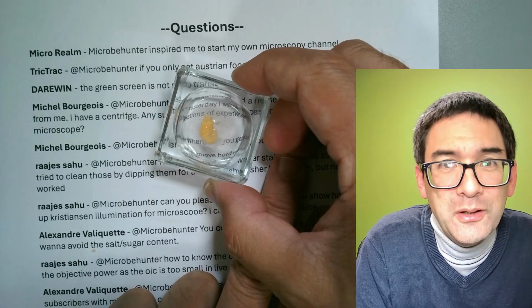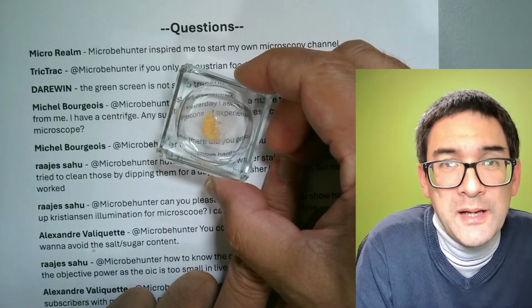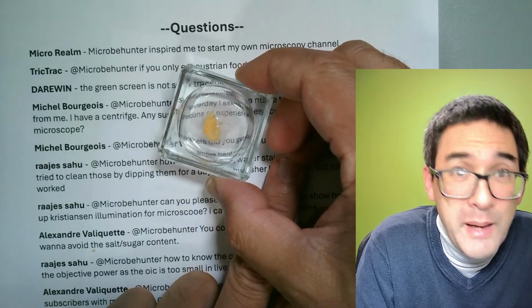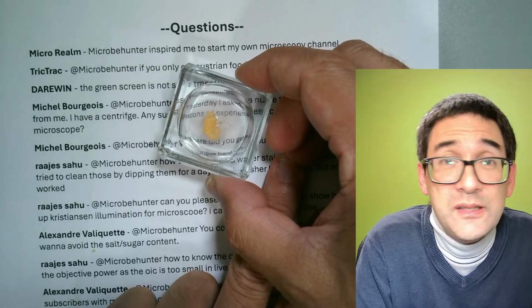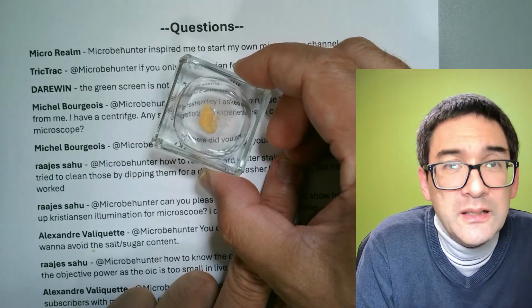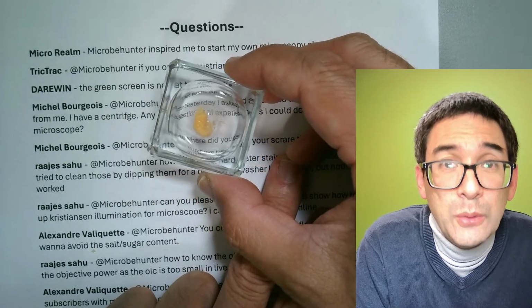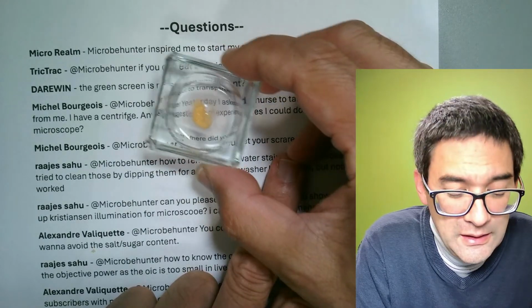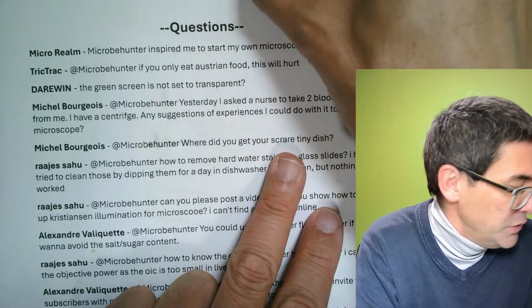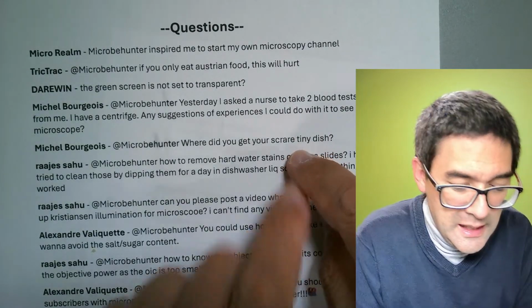I'm a teacher, and we have catalogs that basically have school supplies and microscopes, accessories, educational material, and this is where I got this from. They're a little bit difficult to get, but if you Google for block dish, as it's called, then you're able to get it. However, what you might also try is getting some small Petri dishes.